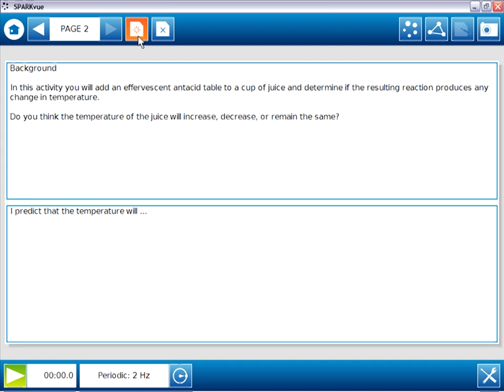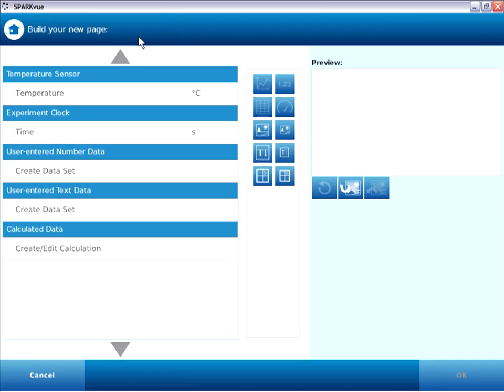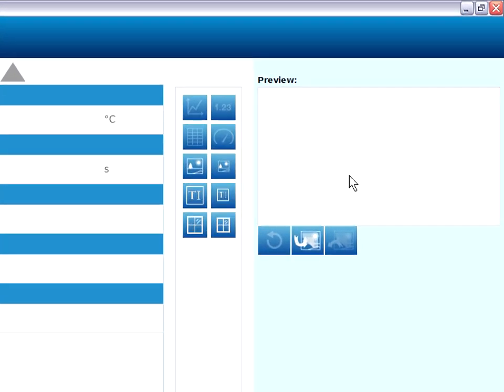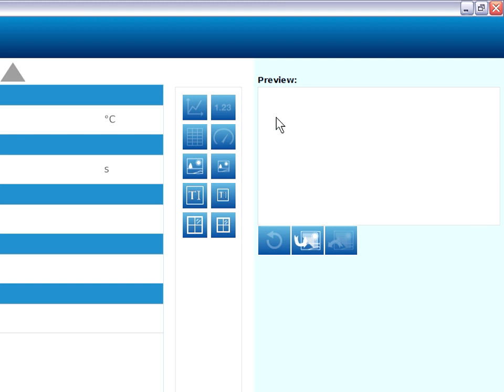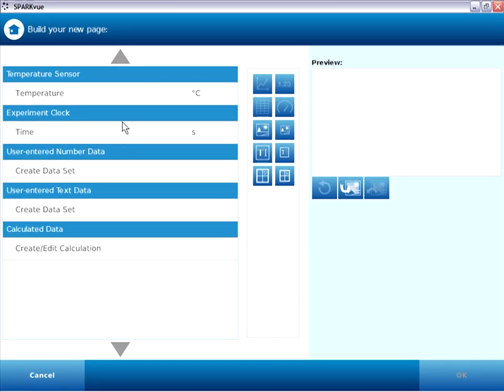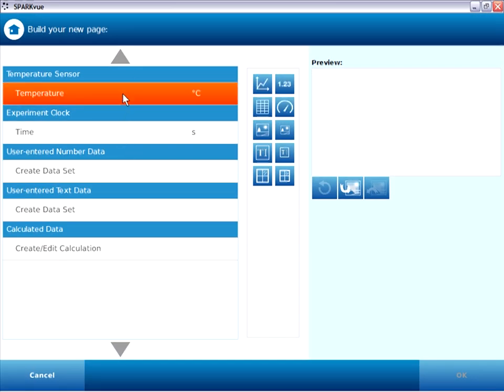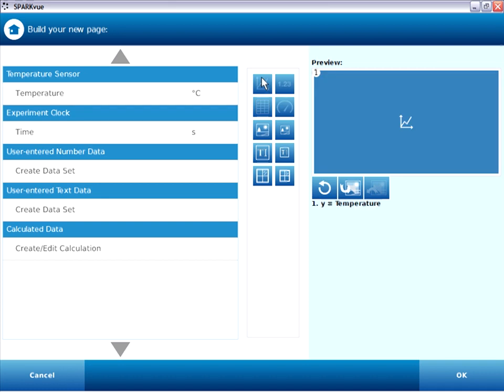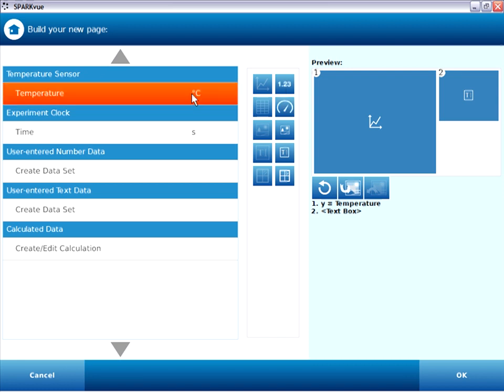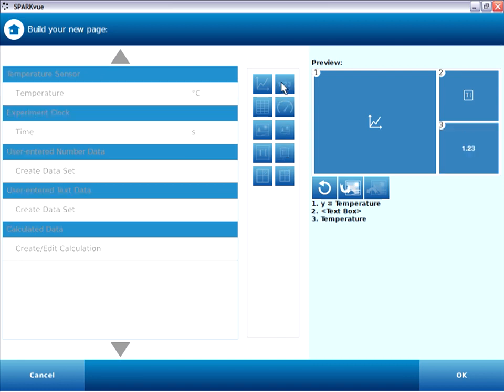Onto page three, build new page. Now on page three, we're going to have three page elements. You may recall there's a graph of temperature versus time on the left two thirds of the page, a small text box of instructions in the upper right, and a small digits display in the lower right. So beginning on the left, I need to add a graph. And graph of course is not available until I choose the measurement from the column on the left. So I'll first select temperature, then a graph from the center column, and I have a graph. This will be a graph of temperature versus time. Next up will be in the upper right, a small text entry box. And finally, I'd like to have a small digits display. So I'll choose temperature again, and digits to complete the page.